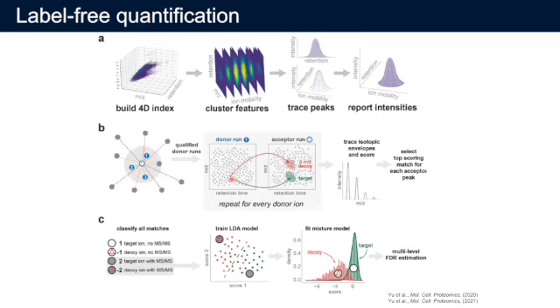And then after it transfers a real peptide, it also transfers decoy ones with a very big m/z shift. Because it has a very big m/z shift, it means that the transferred decoy peptides are definitely to be false. And these decoy peptides will be used later on to build models to estimate the FDR for the match between runs.